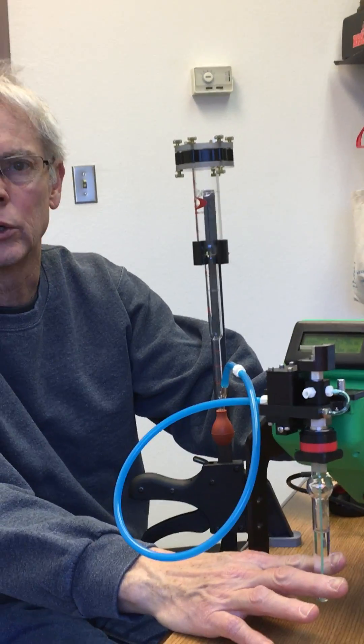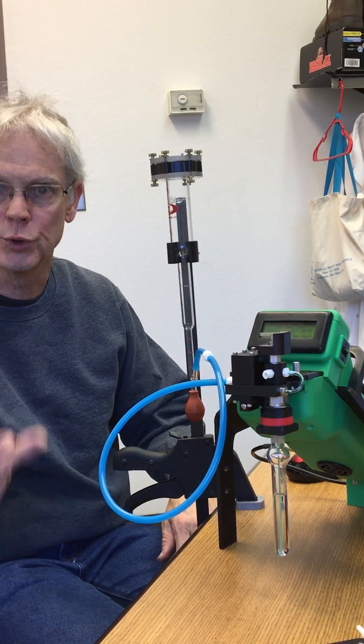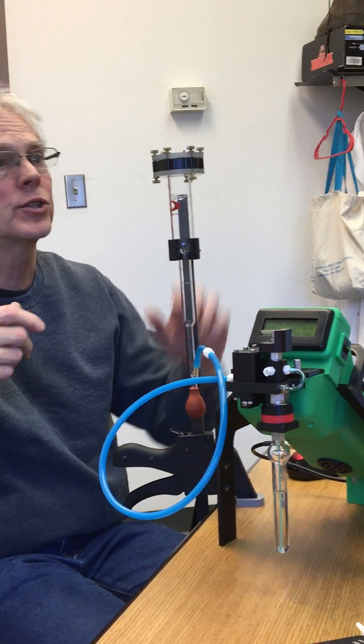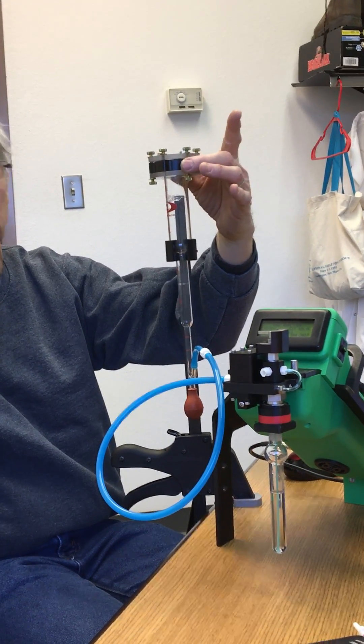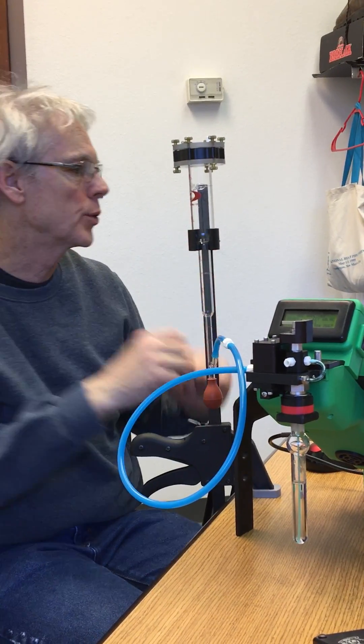It's basically set up with a sparge bottle, so we're going to measure the sparge flow rate. You can also use it to measure the flow through the GC column, and it's got an adapter up here that allows you to measure the air collection flow rate too — so one bubble meter can do all three.